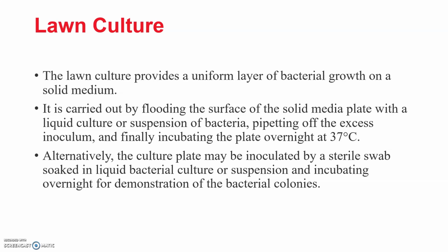Alternatively, the culture plate may be inoculated by a sterile swab, which is soaked in liquid bacterial culture or suspension, and incubated overnight for the demonstration of bacterial colonies.